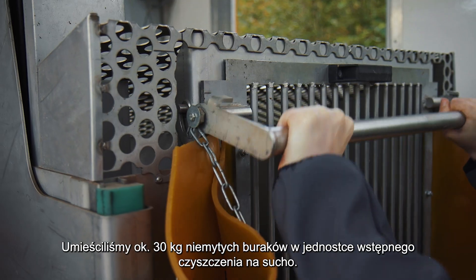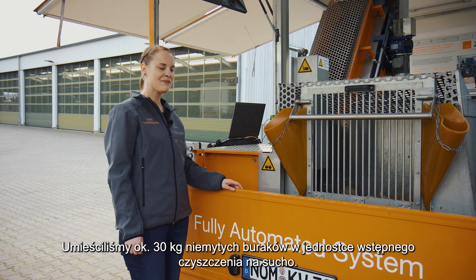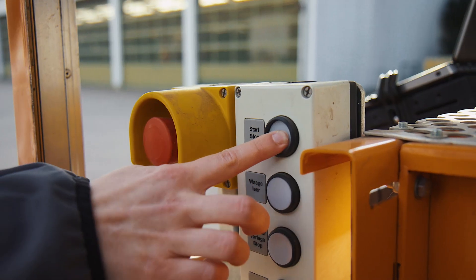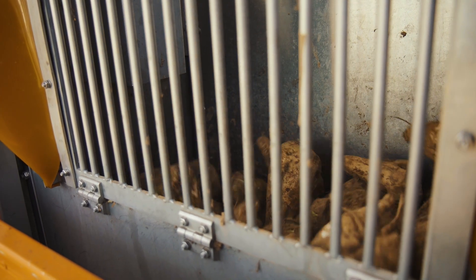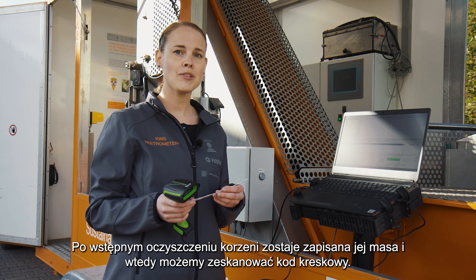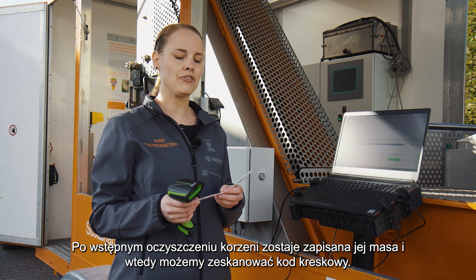We have fed about 30 kg of unwashed sugar beet into the pre-cleaning unit. After pre-cleaning, the sample weight is recorded and we can scan the barcode of the sample.